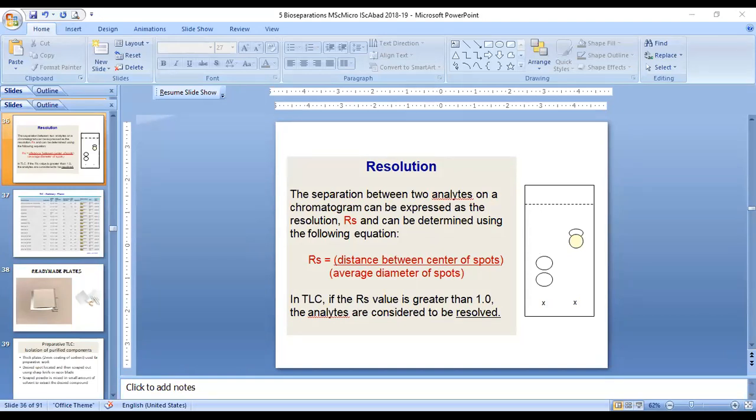ओके, so I was telling you about the resolution. तुम्ही जर इथे डायग्राम मध्ये बघितला तर इथे, भीमभूषण तुझा माईक बंद कर. ओके, can you see the two spots here which are away from each other slightly? त्यांच्यामध्ये काहीतरी डिस्टन्स आहे. आणि दुसऱ्या पॅनेलमध्ये जर तुम्ही बघितलं तर here the two spots are almost like they are overlapping. दिसतंय ना?